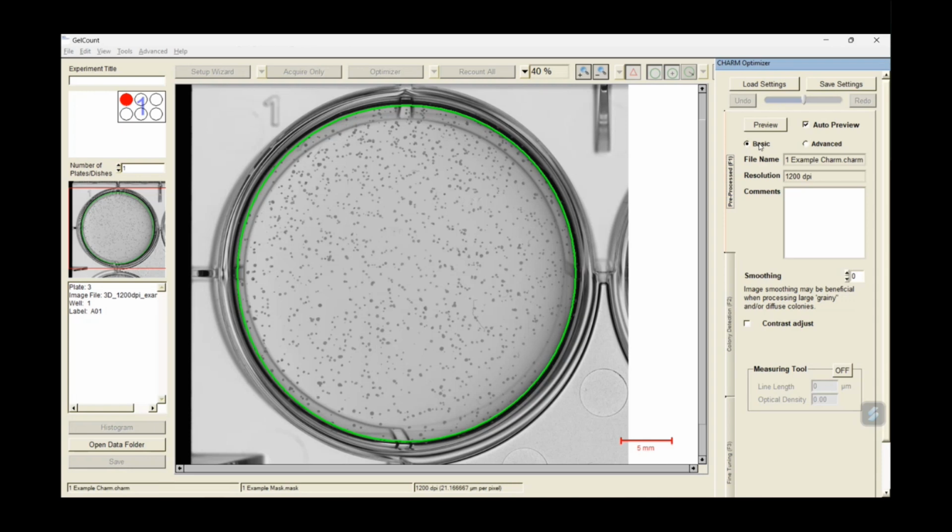Before I move on, I do want to quickly explain how these 3 tabs work. The way they are meant to work is in a top to bottom fashion, meaning any change made to the available settings in an individual tab will have a downstream effect on the tabs below it. So we always start from our top tab and work our way down. The idea here is that by optimizing and adjusting the tools and functions provided, we'll end up with the sort of decision making by the algorithm that we feel is appropriate for our study. So with that, we will start with our pre-process tab, which is the one we're already in.